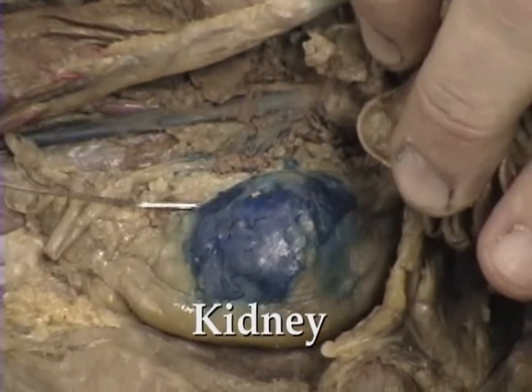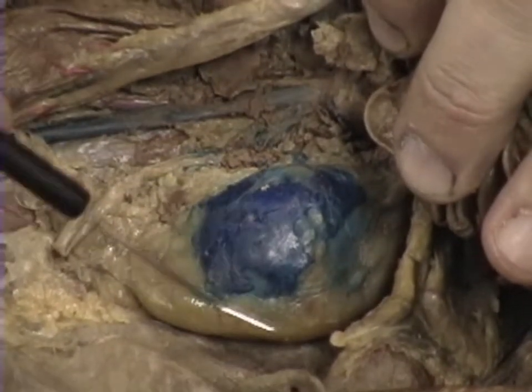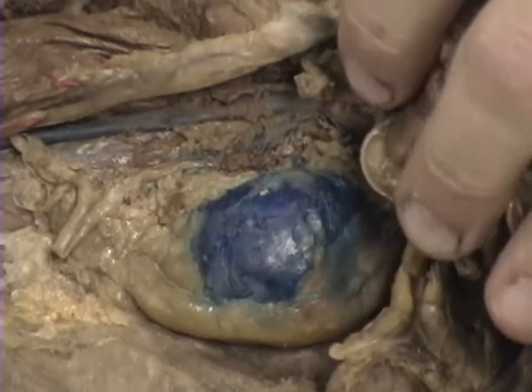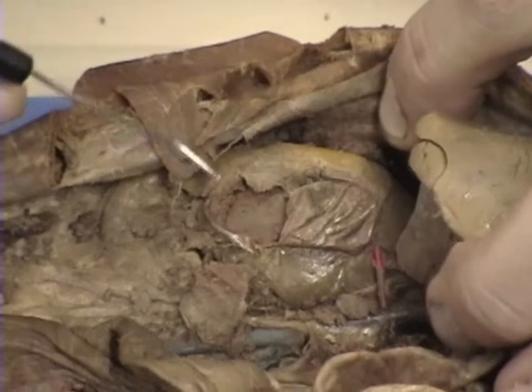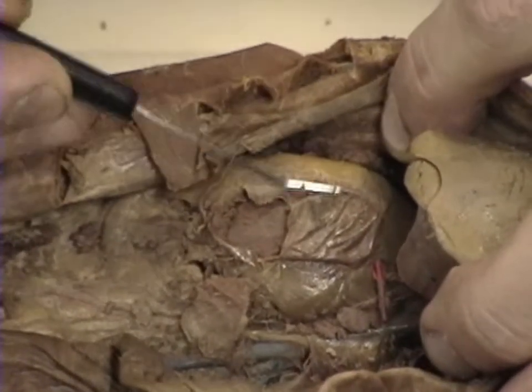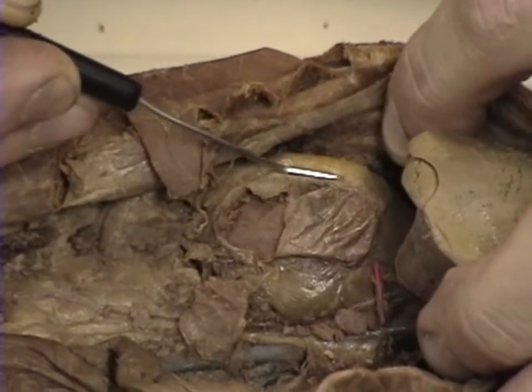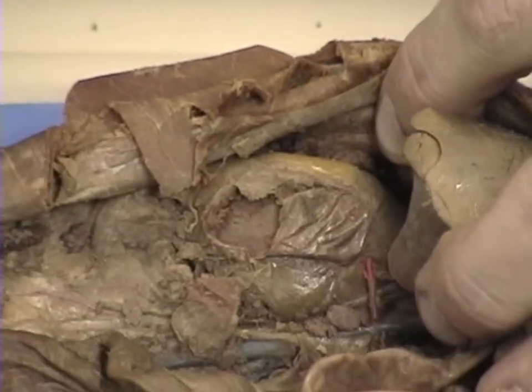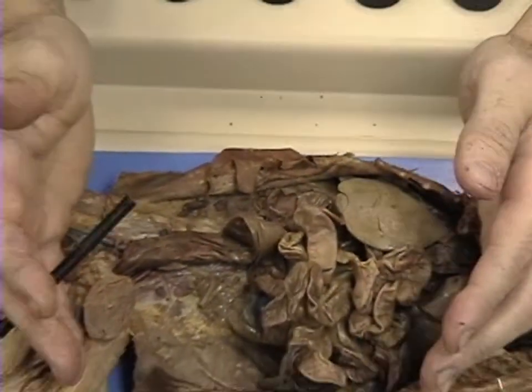This is one kidney here. It's stained because the veins have been injected. It's been stained blue. And on the other side, over here, a kidney that hasn't been stained so well. And this is the other kidney right here. Most of the kidneys are surrounded by a membrane and also by adipose. We'll stop there now for the abdominal cavity of the cat.